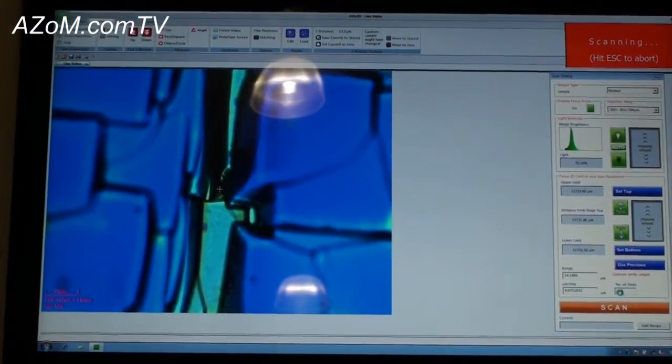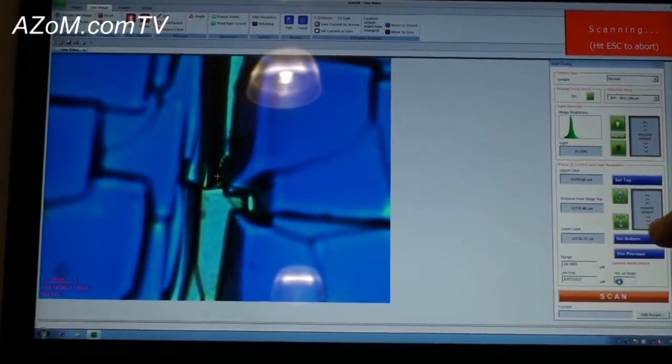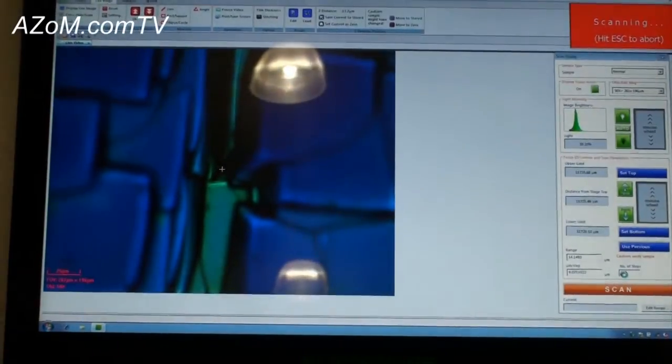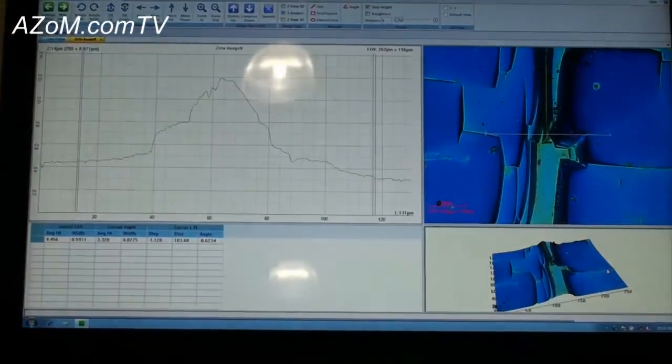I'll have the 2D infinite focus image here. I'll have a 3D image located here. And the actual numeric values associated based on the cursors.